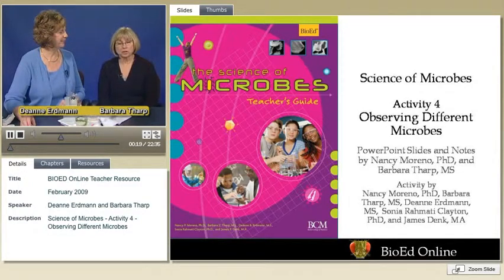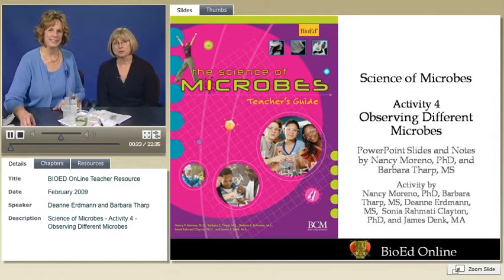Today we're going to look at observing different microbes. It's the fourth lesson in the Science of Microbes series. You'll find that all of our activities are aligned with the National Science Education Standards, and this goes along with both inquiry and life science standards. In this activity, students will use a microscope to become familiar with 3 different microbes: bacteria, fungi, and protists.